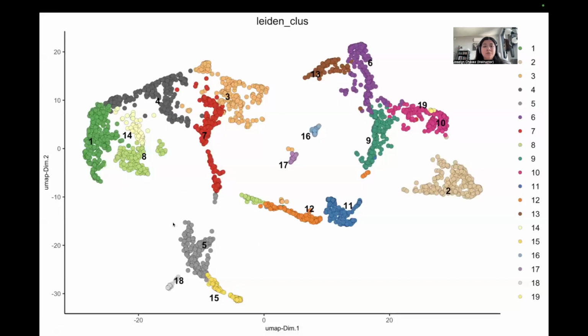Instead of just observing blue points, now we have the colors of the individual clusters. And now we can even confirm that our processing workflow and also the clustering were good, because you expect to see kind of separated individual clusters here.